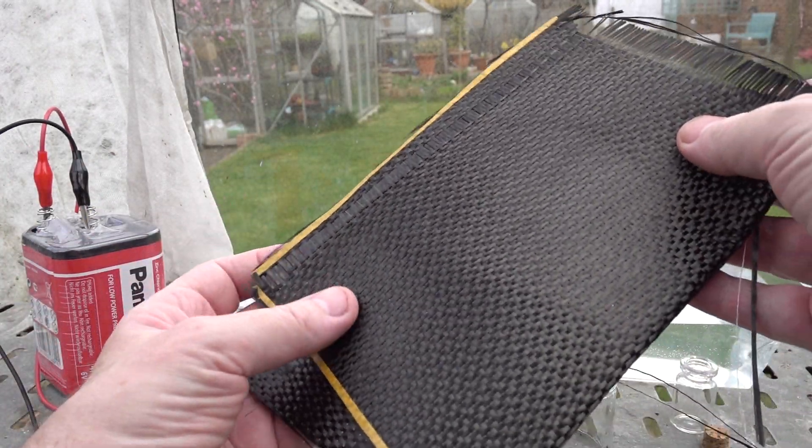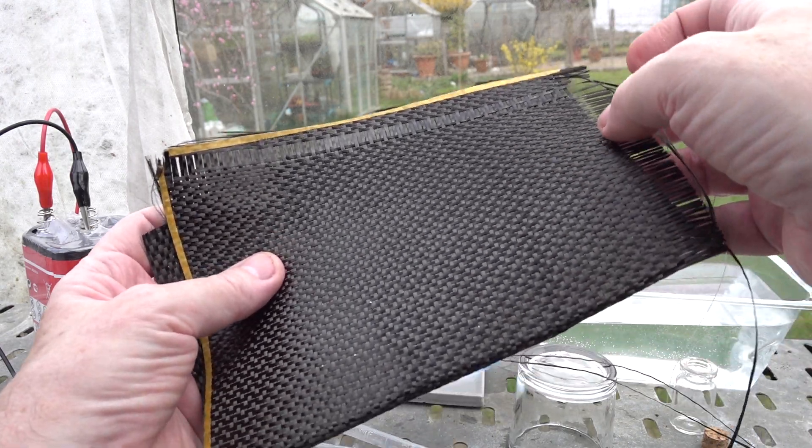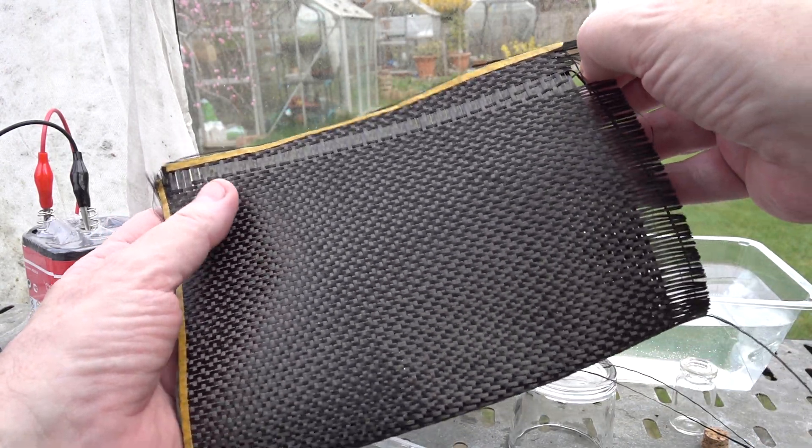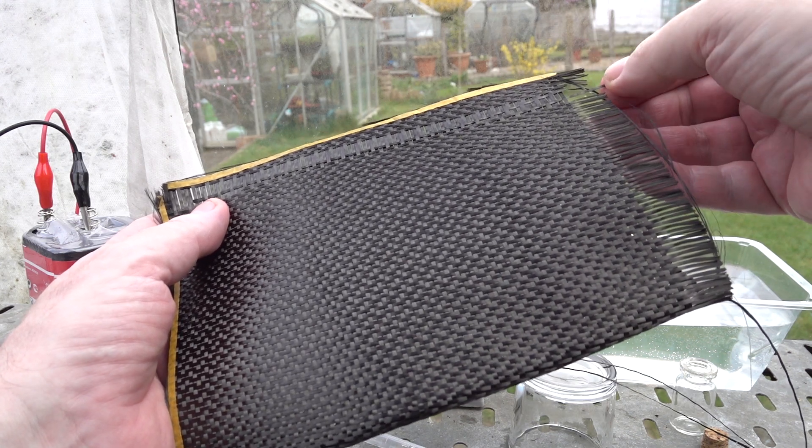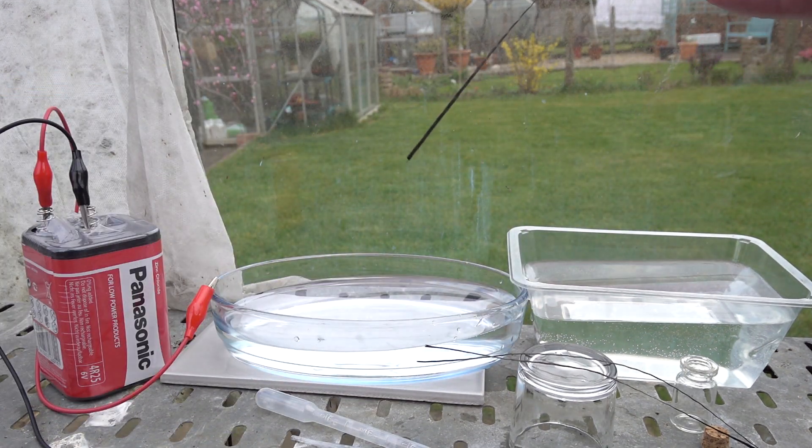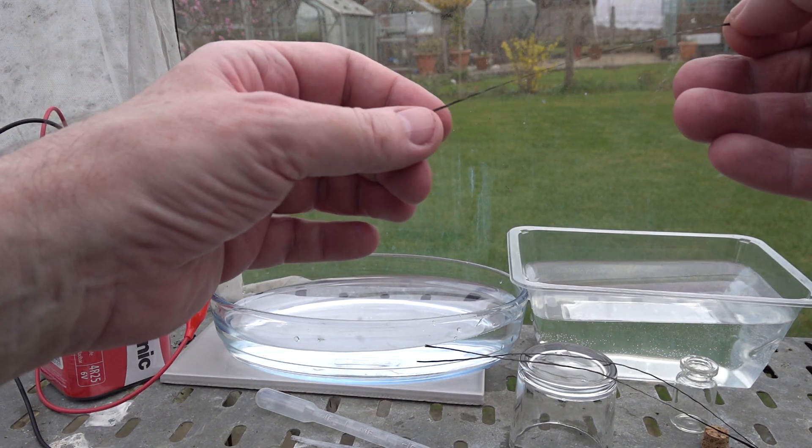We're making the electrode from a strand of carbon fiber from this woven sheet, very inexpensive to buy online. Once you cut the threads they will come out really easily, as you saw that one.